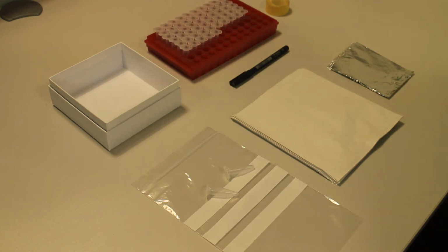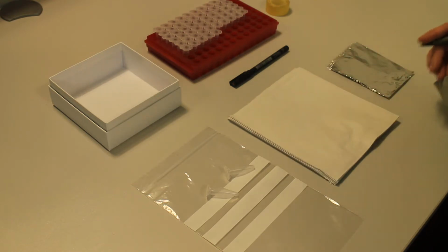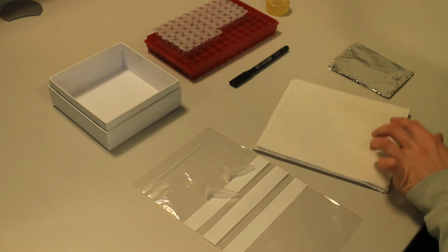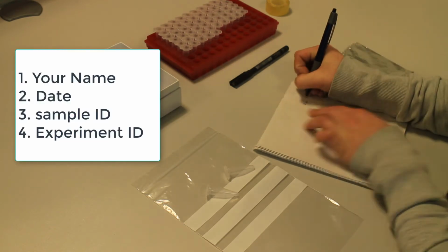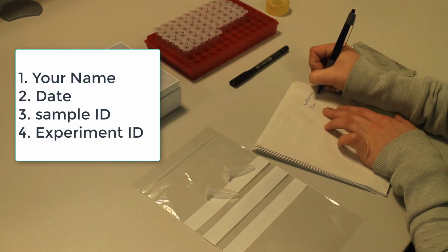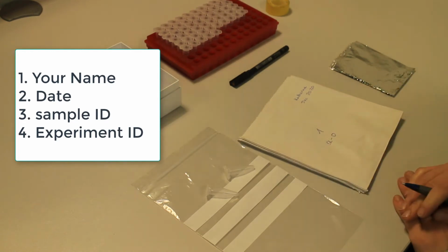So I've lined up a few things that you might want to label on the time you're in the lab. Let's start with the paper bags. They are for dry weight. What I would want to put on those is my name, day or at least month, and sample number. And then I will put the experiment as well.